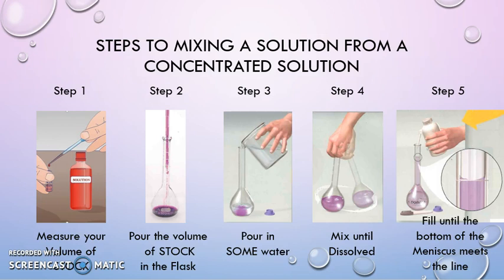You can't just take the solution back out, because then you're removing the solute, the stuff that's dissolved in there. Unfortunately, usually what this means is you have to remix your solution. So pay a little bit of attention, make sure that you take a little bit of care when you're mixing your solutions, and I'm sure you will have success.